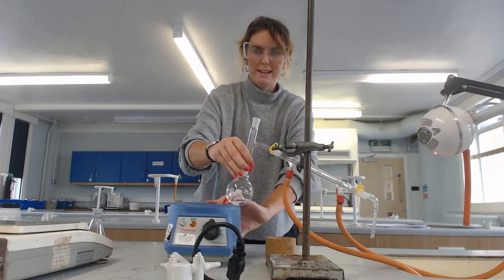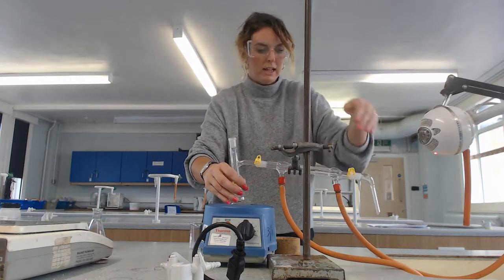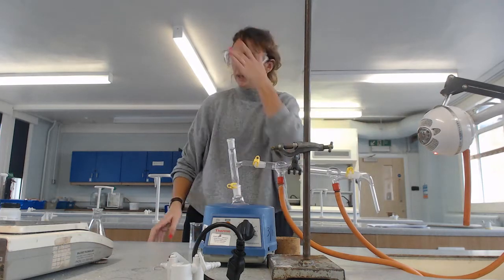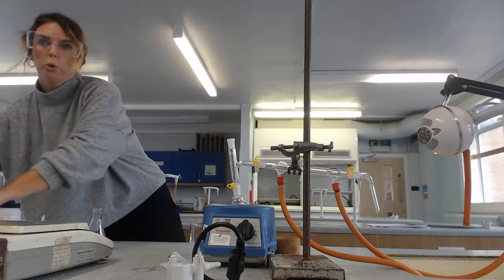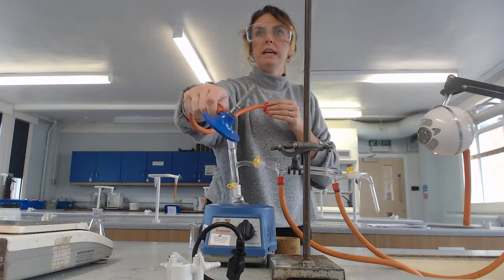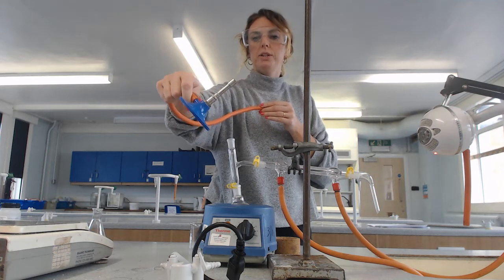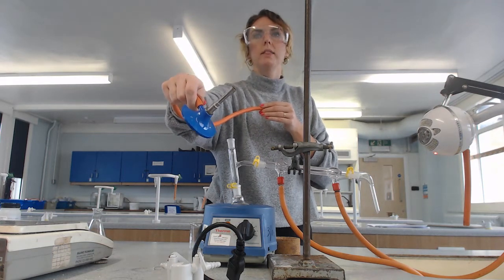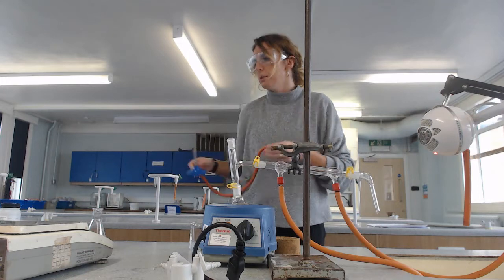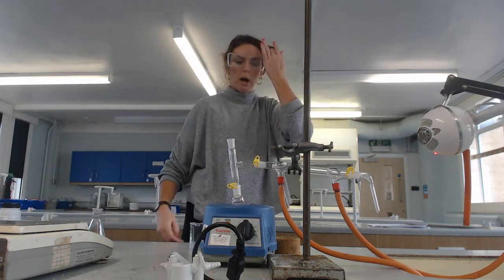In reality in the lab you'd probably use a Bunsen burner, or better still a micro burner — those are the ones you take out of the cupboard in F8. The reason you'd use a micro burner rather than a Bunsen burner, or perhaps better still a boiling water bath, is that you need to heat this quite gently.